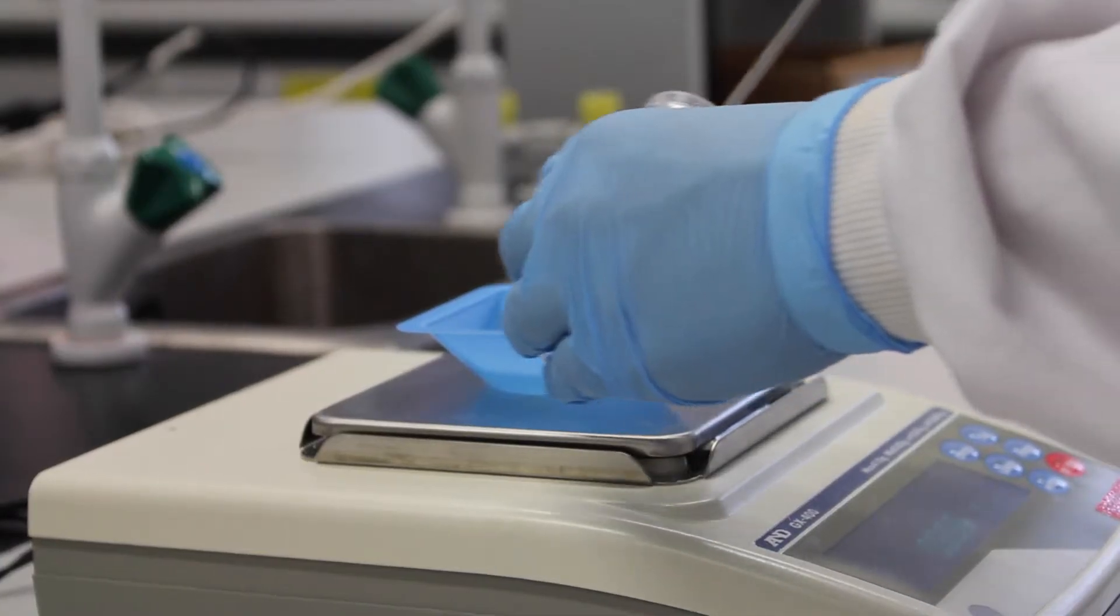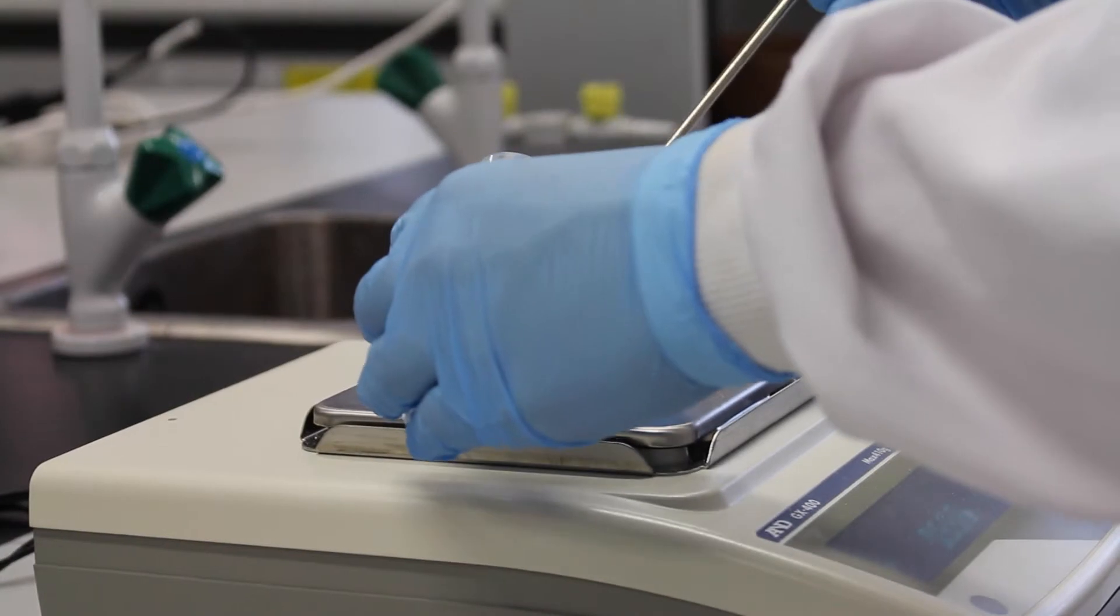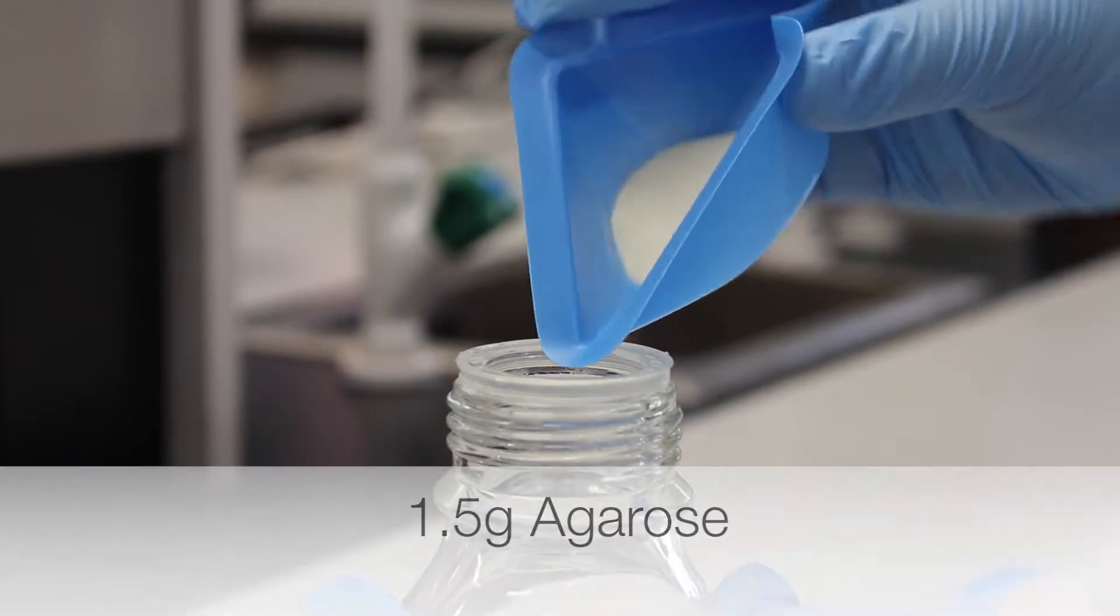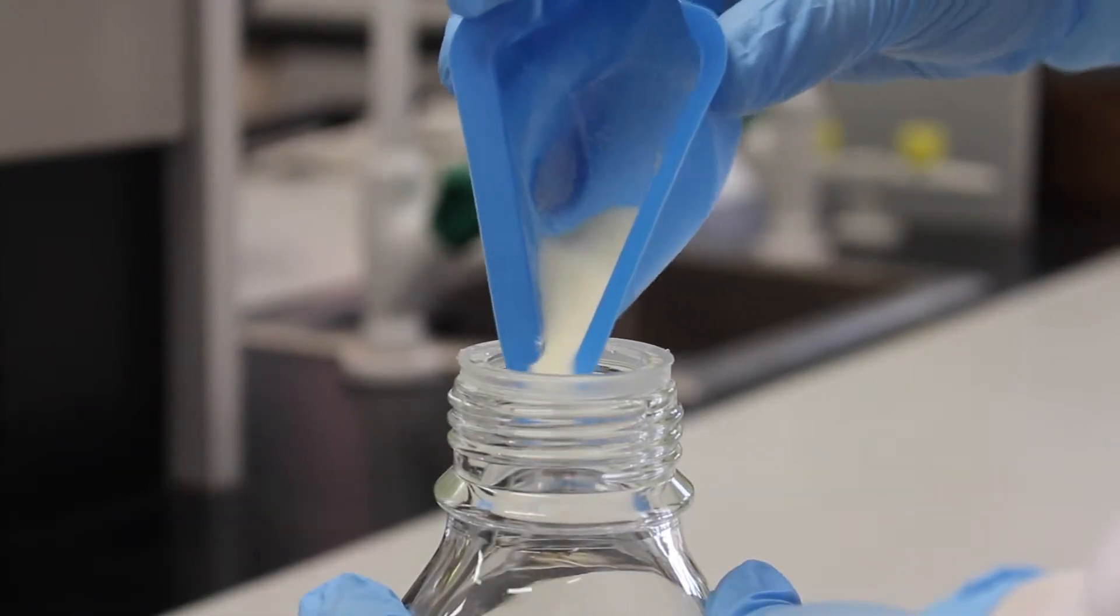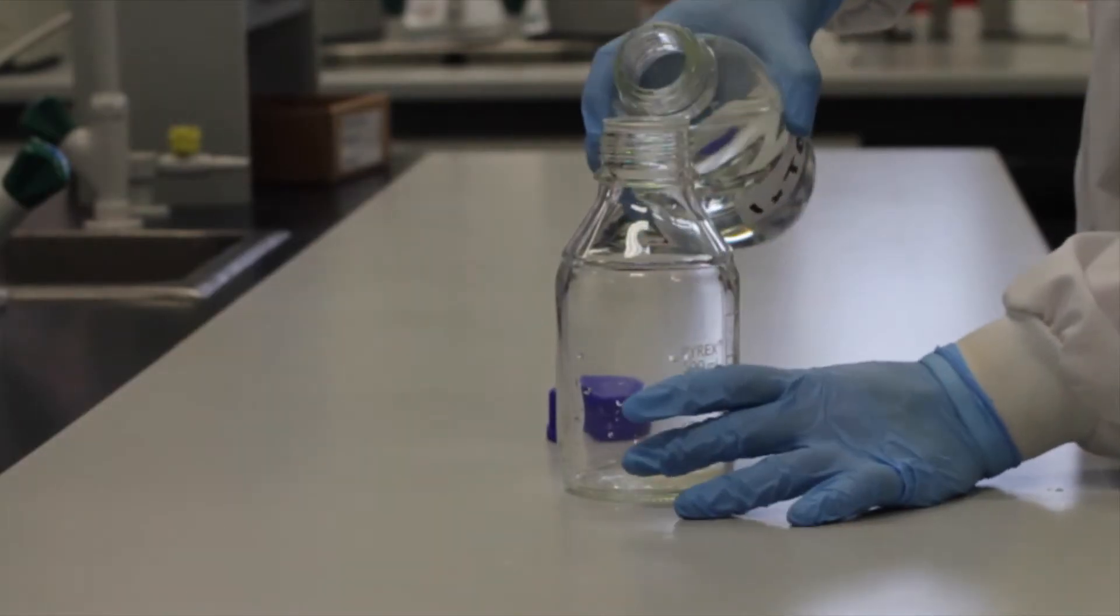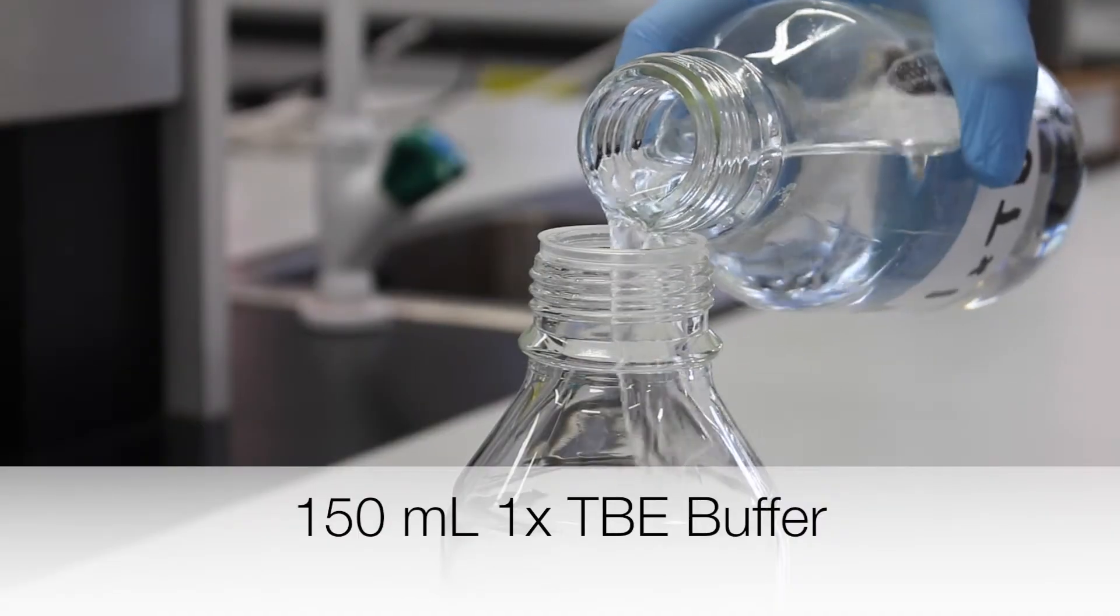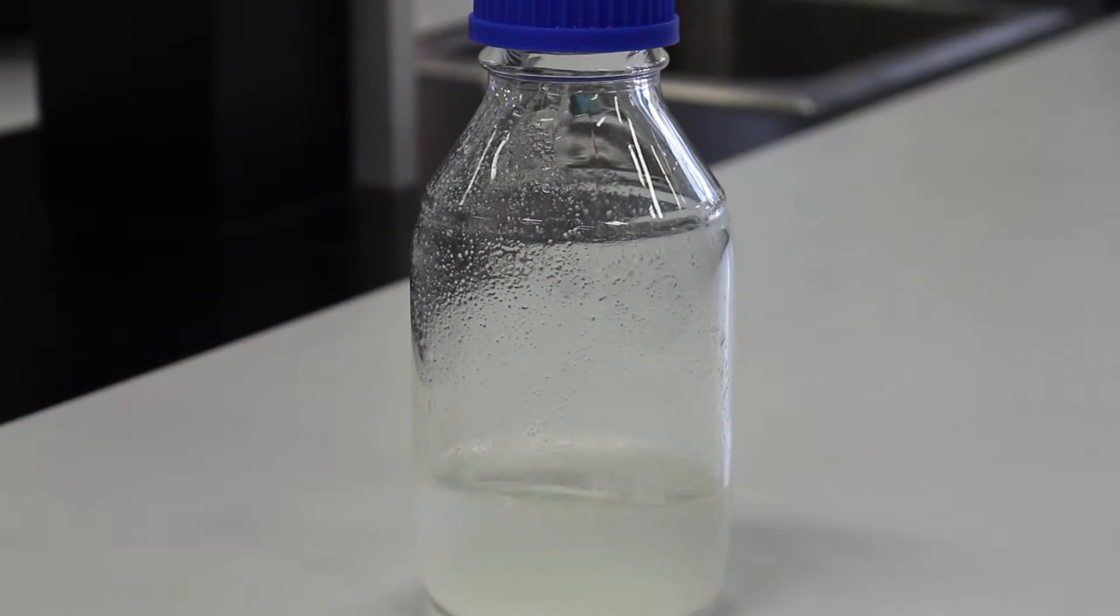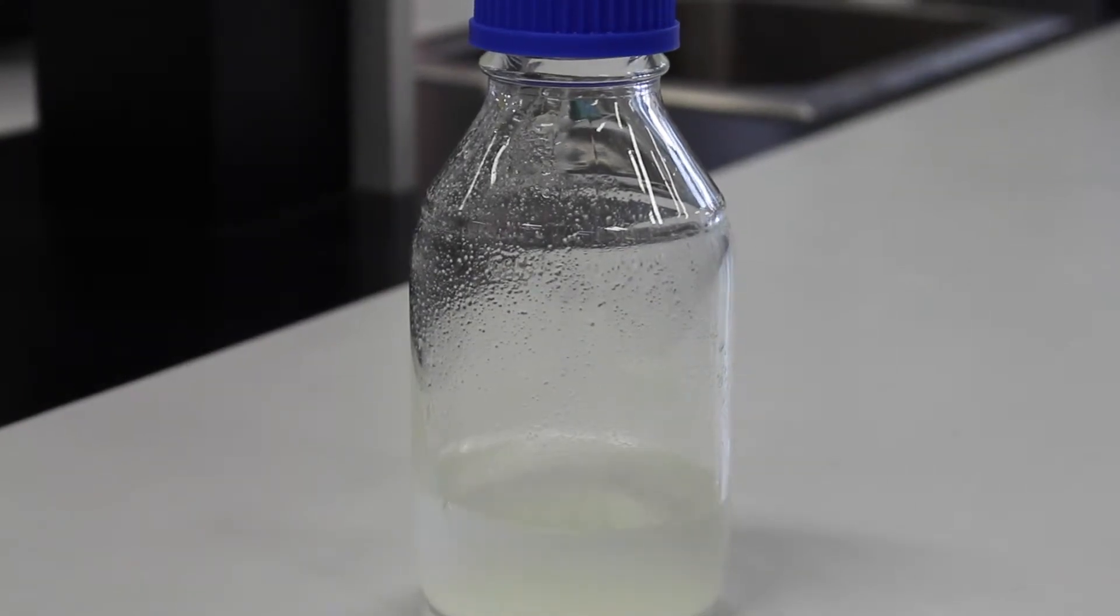For 150 milliliters of a 1% agarose gel, 1.5 grams of agarose powder is weighed out. The agarose is transferred to a glass bottle. 150 milliliters of TBE buffer is added. The glass bottle is swirled to fully dissolve the agarose quickly.